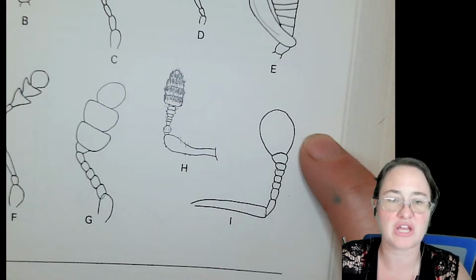And I was corrected, that last segment right there is actually just one large bulbous segment at the end. And funny enough, this is even the same genus of beetle as what we're looking at here, because this is figure I, and I over here is Hololepta hystrix. How nifty is that? Alright, so that's the antenna type we're looking at, and I'm going to finish drawing this last bulbous segment here.